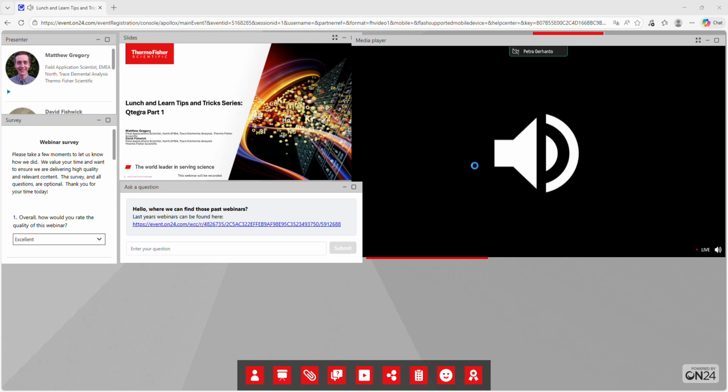Okay, I can take this one. So I would say you can auto-tune every day, although maybe not necessarily essential. Obviously if you tune every day, you're making sure your system is in optimal condition. But really, we would recommend running performance reports every day. So as long as your performance reports are passing, I wouldn't necessarily say that you need to do the tuning.